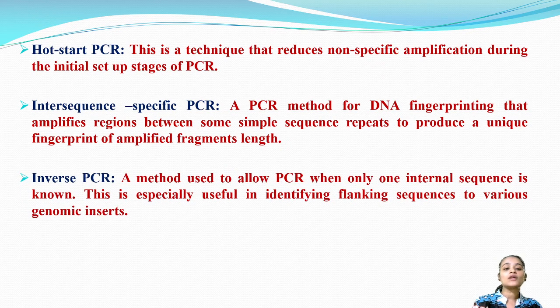Now let us see what is inverse PCR. It is a method which is used to allow PCR when only one internal sequence is known. This is especially useful in identifying the flanking sequences of various genomic inserts.